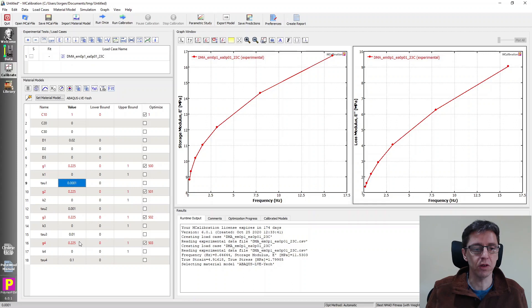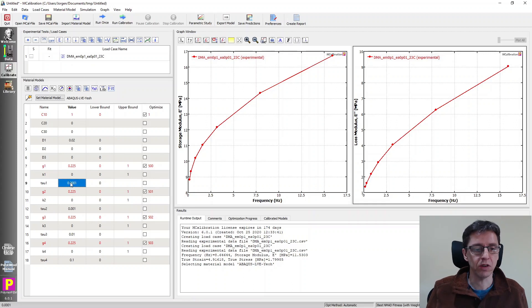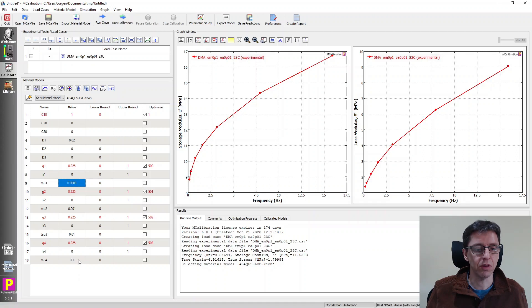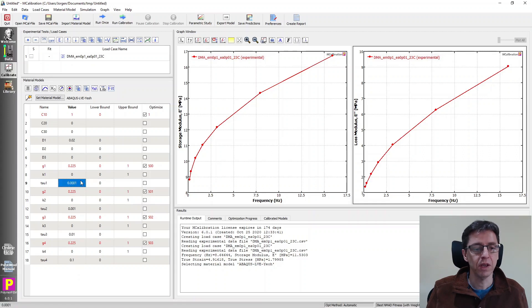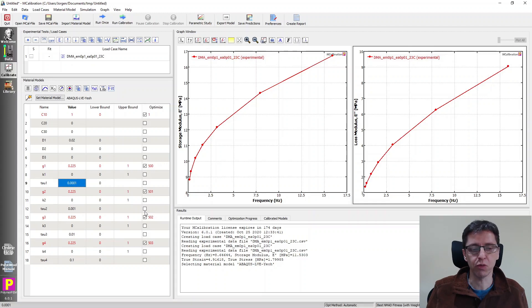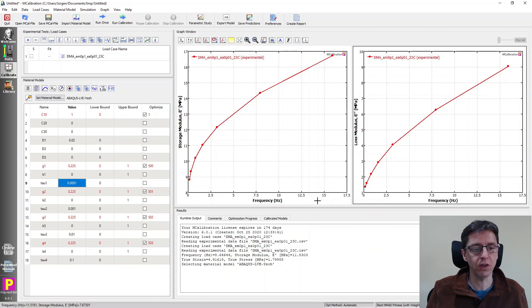And there's only now shear relaxation terms. Then we look at the frequency, the characteristic time values are reasonable. It goes from 10 to minus 4 to 10 to minus 1. And that's sort of in line with the frequencies that we're interested in. So that sounds pretty good.